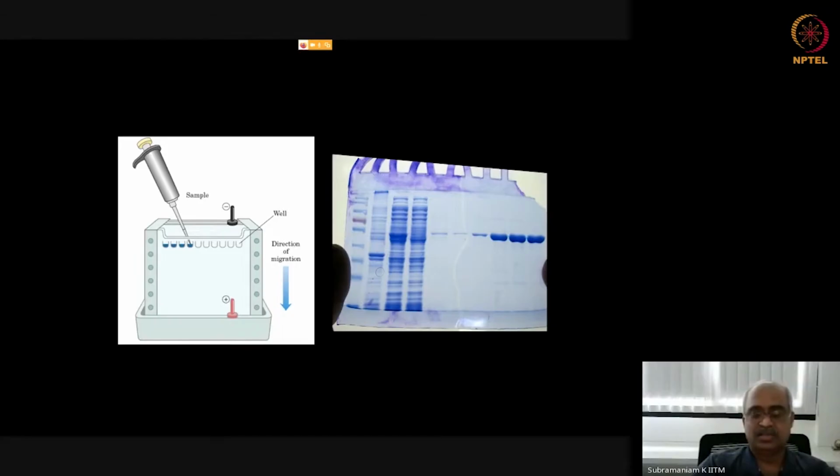Essentially, the long polysaccharides are hydrated in this heating process with the buffer. The buffer is primarily water. So now when you allow it to cool, it slowly becomes a gel. It solidifies and becomes a uniform gel.